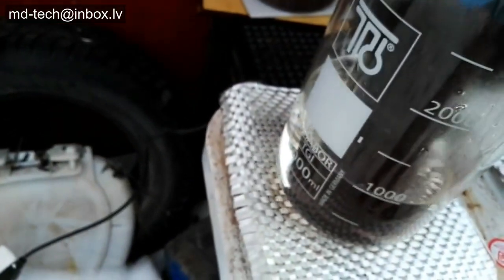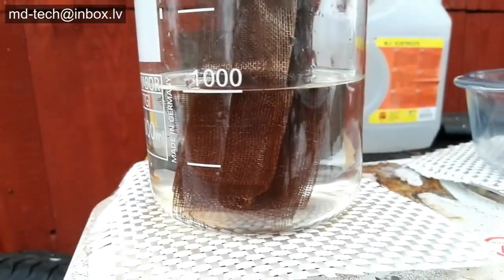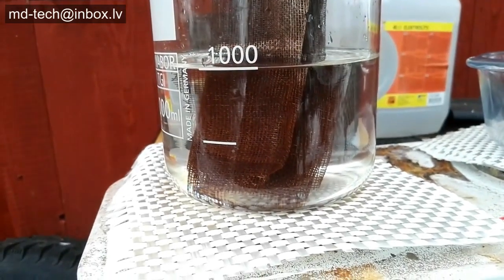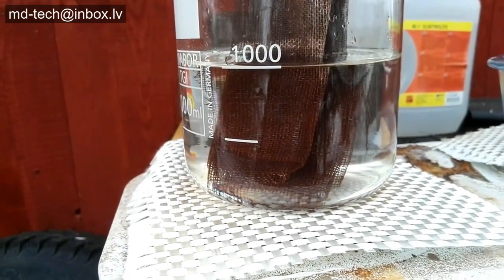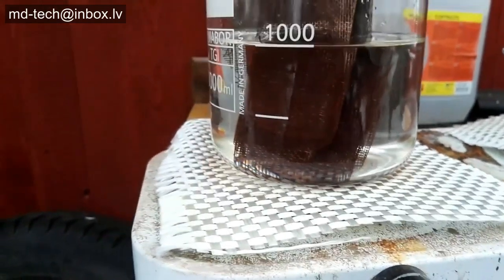I place iron cloth into a beaker and heat it up with battery acid. Iron slowly reacts with sulfuric acid and needs time to form salt.